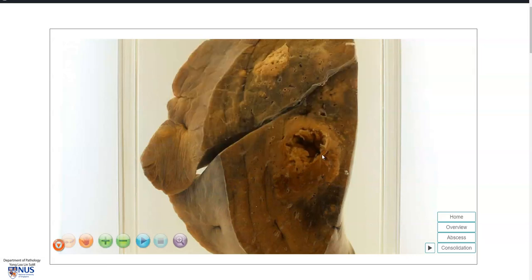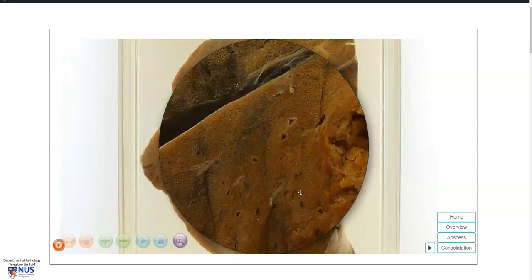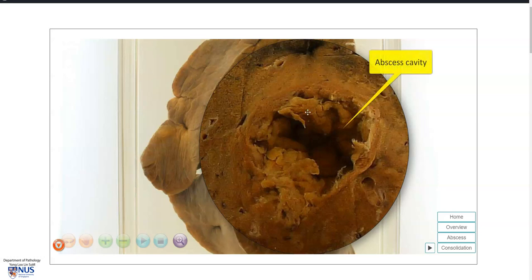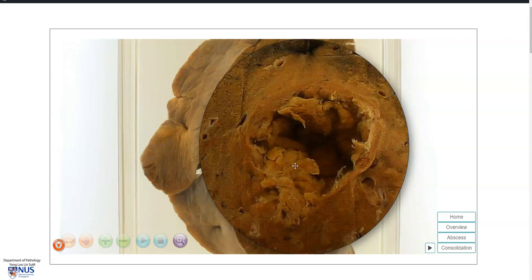Over here we have a cavity. This cavity contains yellowish purulent material. In the fresh specimen it would appear thick yellowish or greenish pus or fluid, and this is really made up of neutrophils as well as necrotic cellular debris.